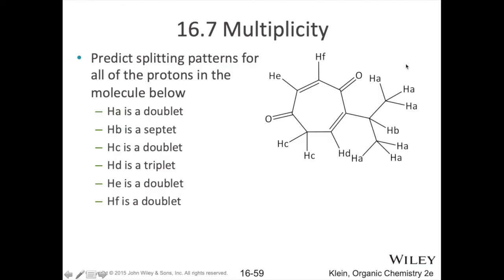Again, all your hydrogens are labeled, and if they have the same subscript, that means they are equivalent hydrogens. If you're having trouble seeing some of those equivalencies, it might help to think about all of the carbons here except for the 2 methyl groups being in the plane of the screen, and then one of these methyl groups sticking out towards you and one sticking away from you.